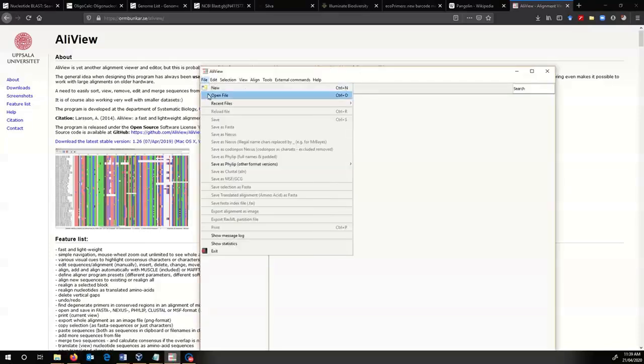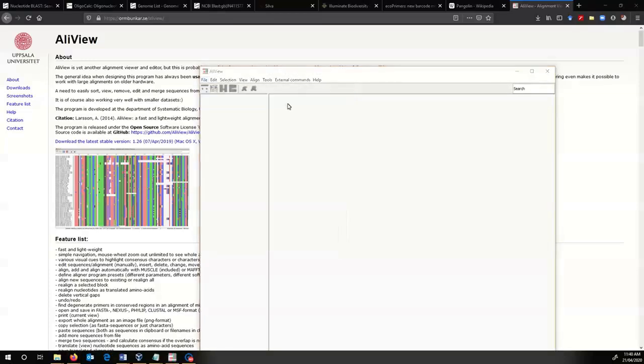So I'm going to open that file that I just downloaded. Sorry, just getting to it. This is making fascinating viewing for you all, I'm sure.